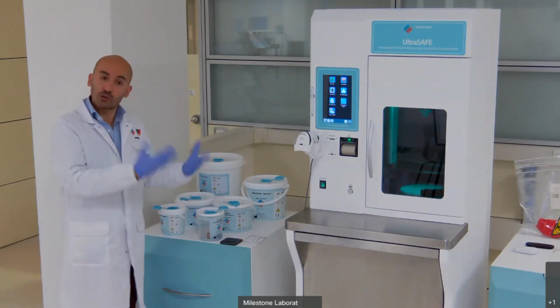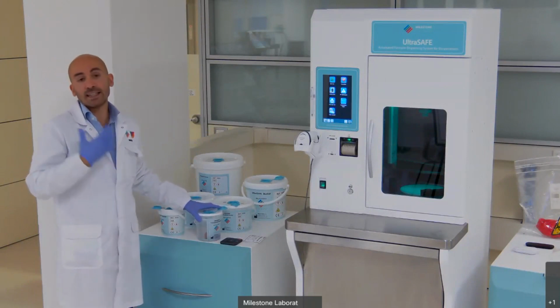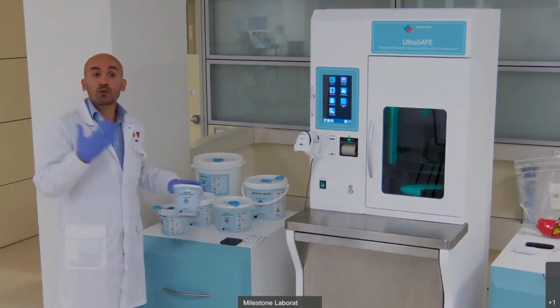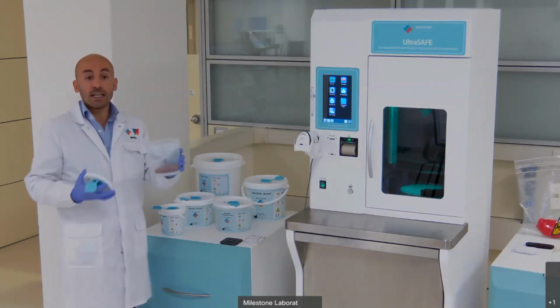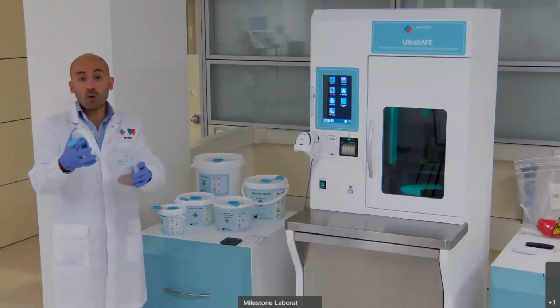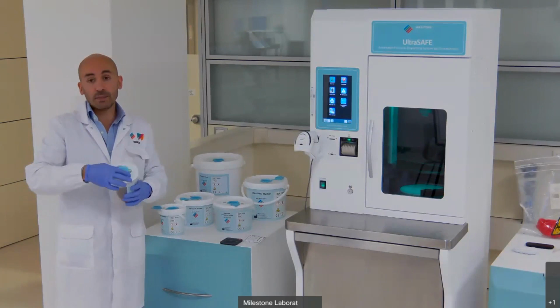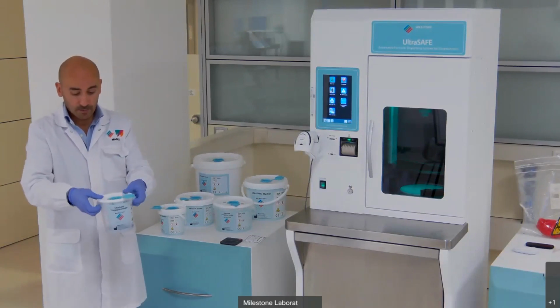In order to introduce you to the practical part, now I will simulate, as I pretend to be the operator, who receives a surgical piece in the surgery room. Now I will receive the specimen and I close the cover here.